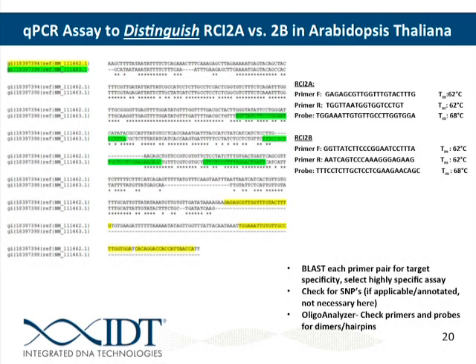So now we want to repeat this. Oh, first we want to do a heterodimer check with our other primer and our probe. All right, and so then looking at these predicted dimers, none of them appear to be very stable.